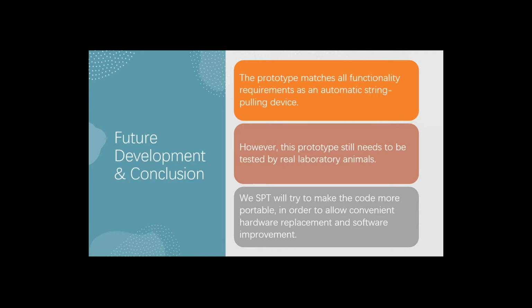Therefore, the string pulling team will try to make the code more portable in order to allow convenient hardware replacement and software improvement. We sincerely hope that Dr. Fenrich and his team can make this device successful in animal rehabilitation.